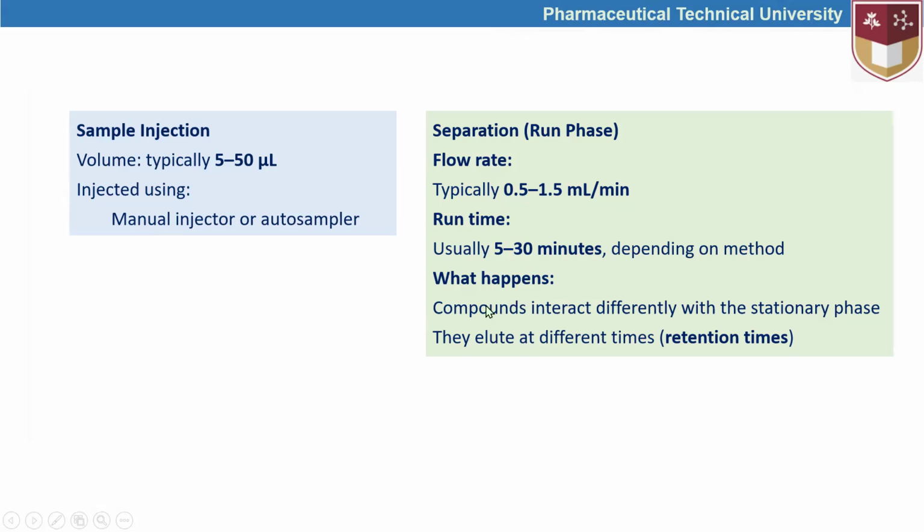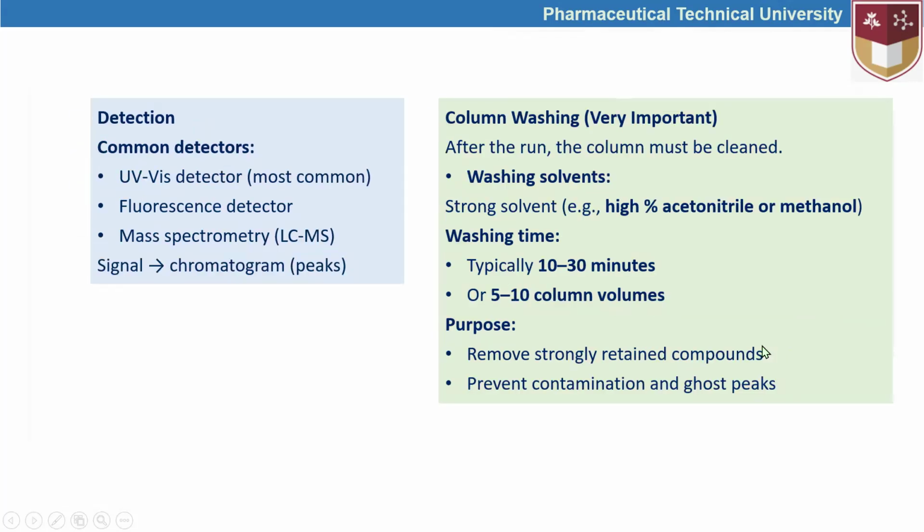Compounds interact differently with the stationary phase. They elute at different times, so they cause different retention times.